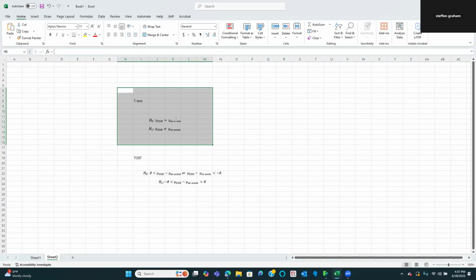And then the other thing about this is when you're doing small scale model verification, qualification, oftentimes you don't have a whole ton of runs at scale or the small scale. There's always this rush to get things done and you don't have all the data you want. And with the t-test, the power is pretty weak with small n, small number of replicates.